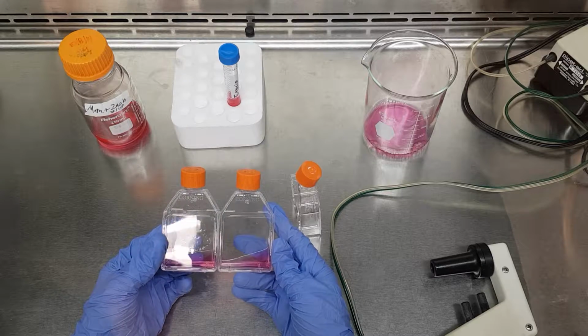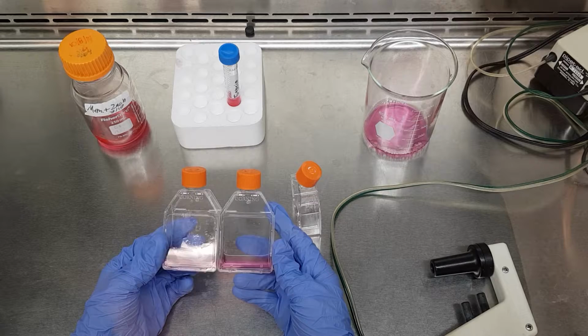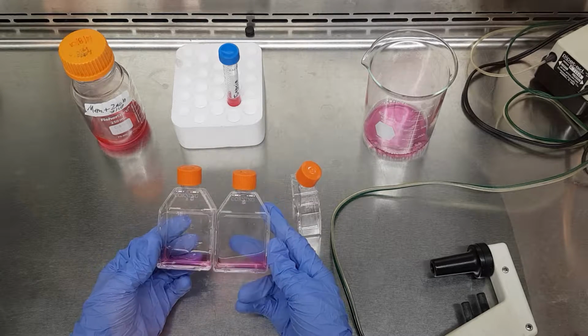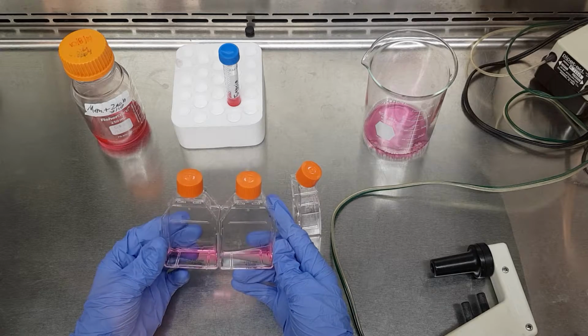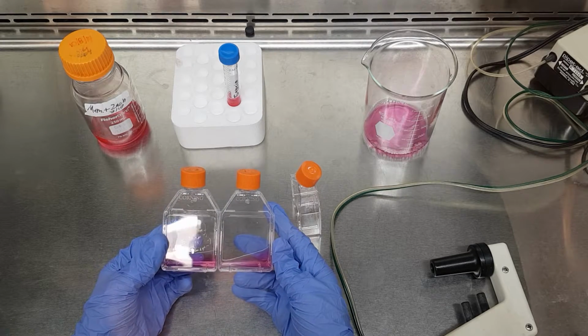Finally, label each of your flasks properly with cell type, passage number, date, and an indicating symbol. Once this has been done, place each flask into the incubator for a 24-hour period.